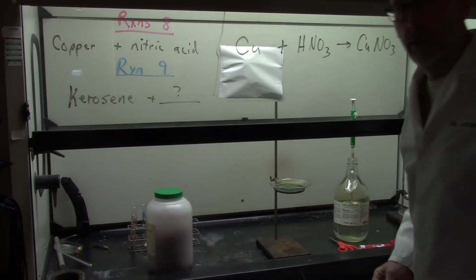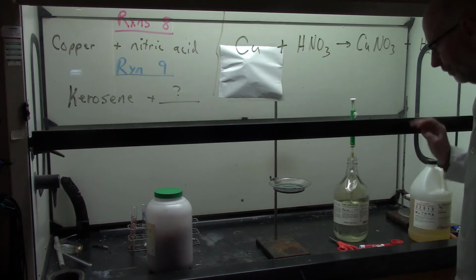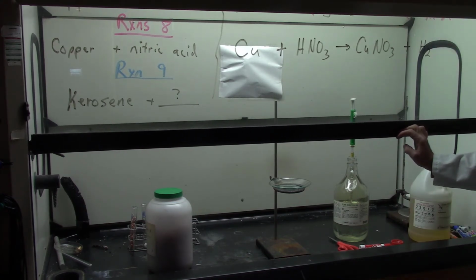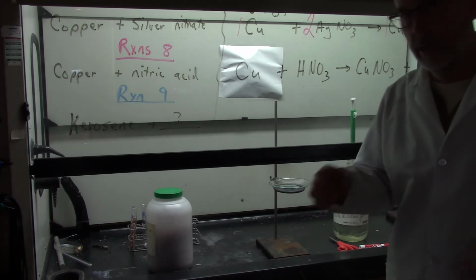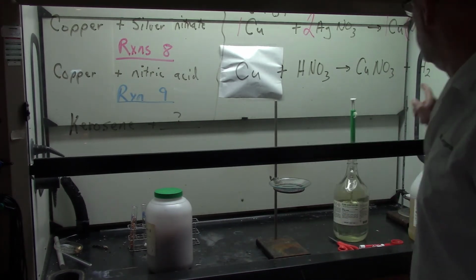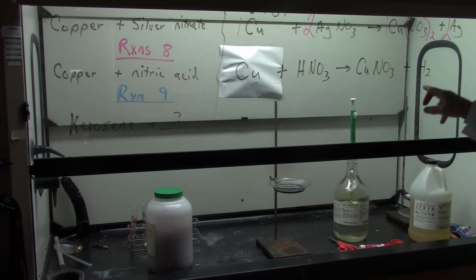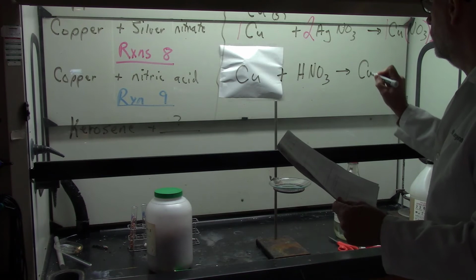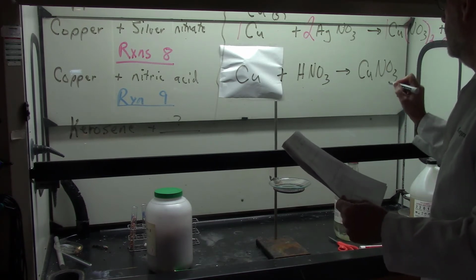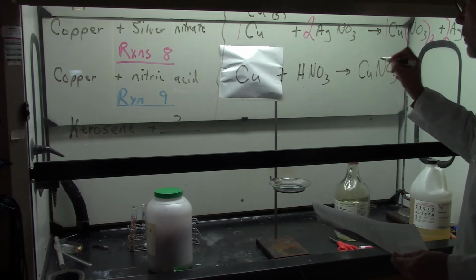Did a reaction occur? You betcha. Alright, a reaction certainly occurred, but it's not really what I expected because hydrogen gas, when we made the bubbles the other day, we had the explosion in the bubbles, that was hydrogen gas, and that hydrogen gas that was coming out of there was clear as could be. This gas is like some sort of weird brown stuff. There is some copper 2 nitrate, and there's a blue solution there, so I think it's copper with a +2 charge.